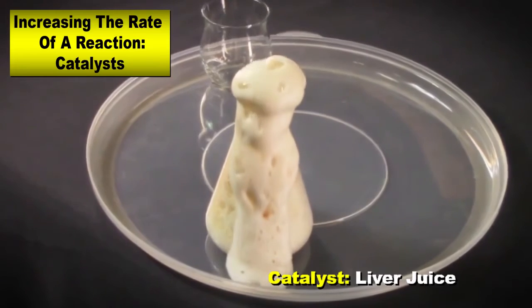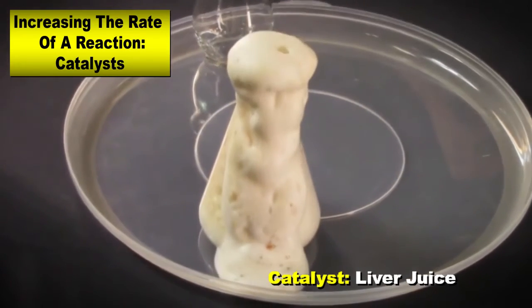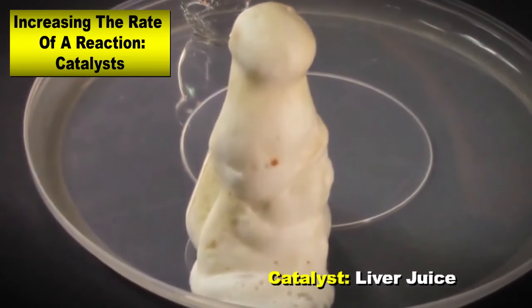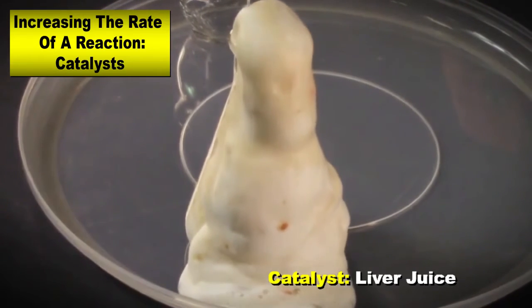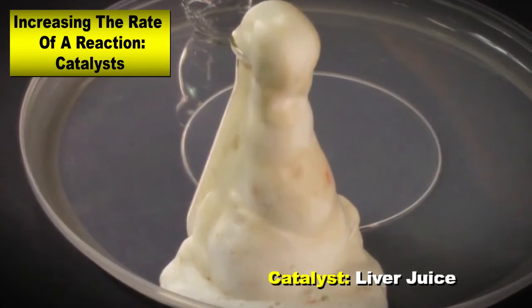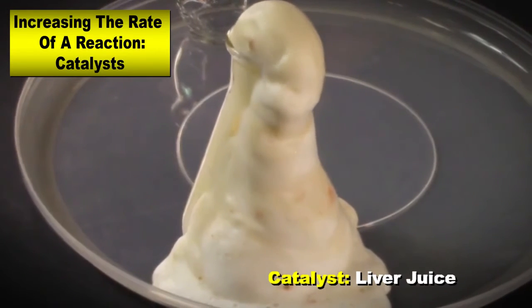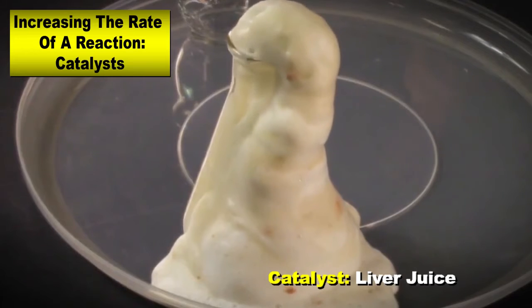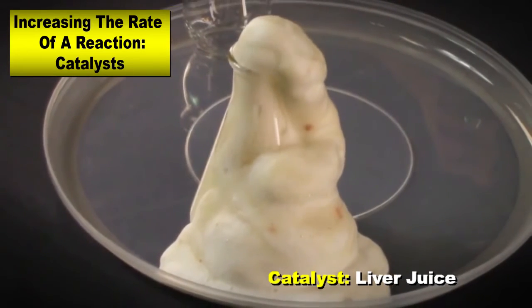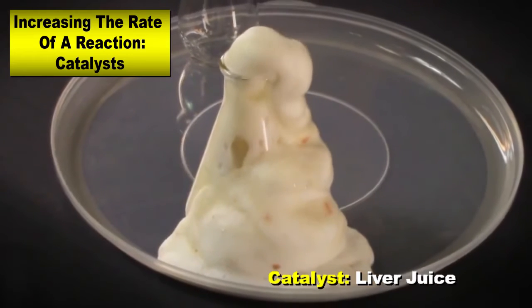That one I would say is even more violent than what we had with the yeast. Oh my goodness, if you can see on this side, we got big old bubbles coming out of this thing. Fortunately, we've got a body that has all the right pieces, parts to respond to any kind of challenge like hydrogen peroxide that would be found in our body. It's kind of beautiful too. It's got kind of a reddish tint to it.